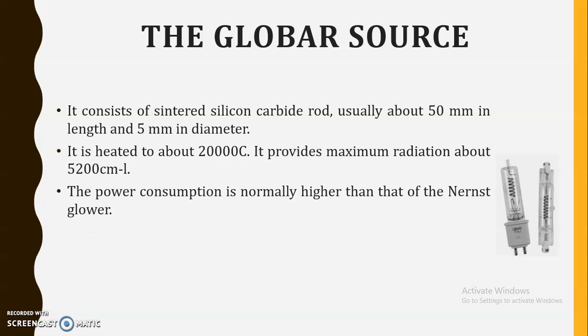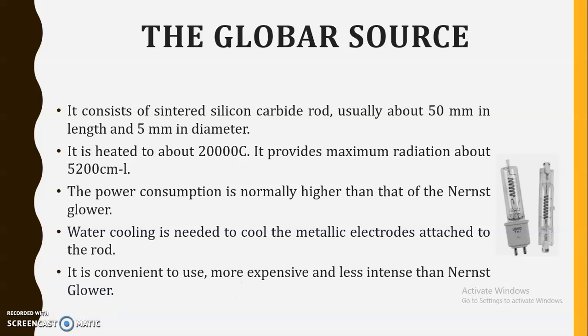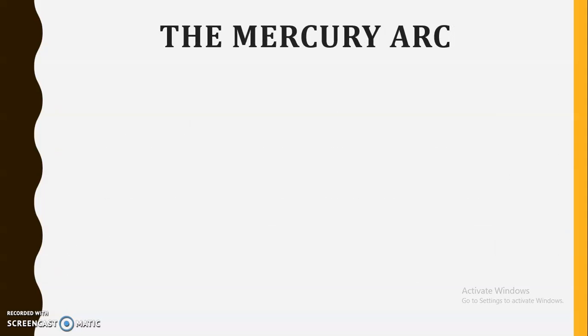The power consumption is normally higher as compared to the Nernst glower, but this is also one of the widely used lamps in IR spectrophotometers. Water cooling is needed to cool the metallic electrodes attached to the rod. It is convenient to use, though more expensive and less intense than the Nernst glower, because the Nernst glower, as I said, has certain disadvantages. It is more expensive, and the Globar source is very convenient to use.